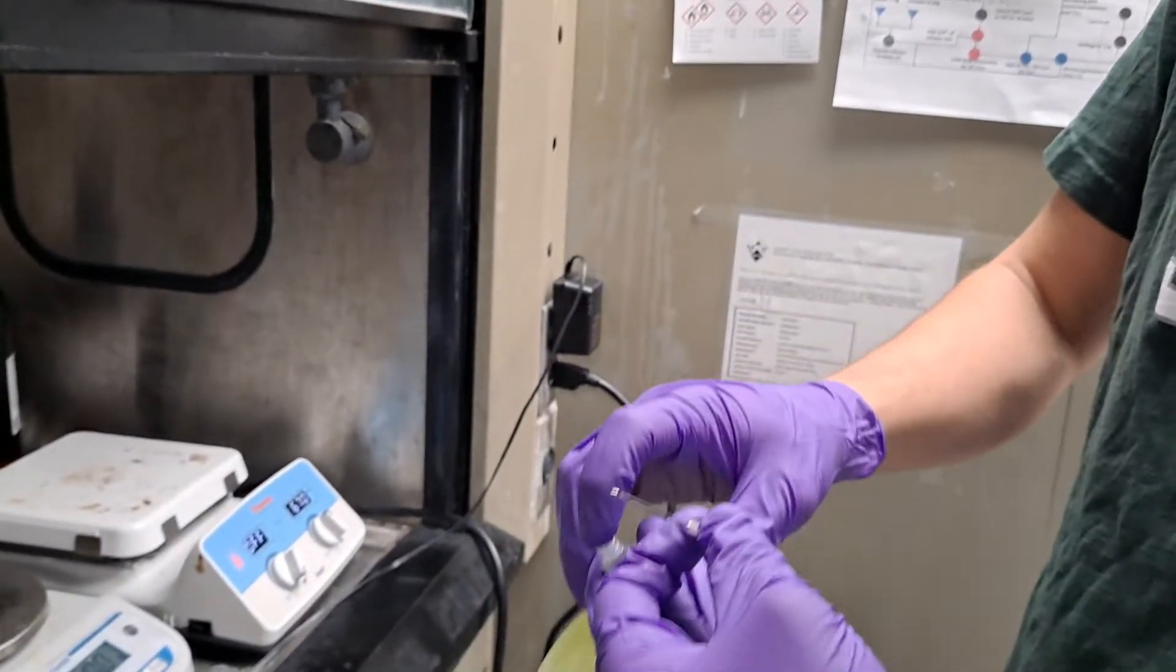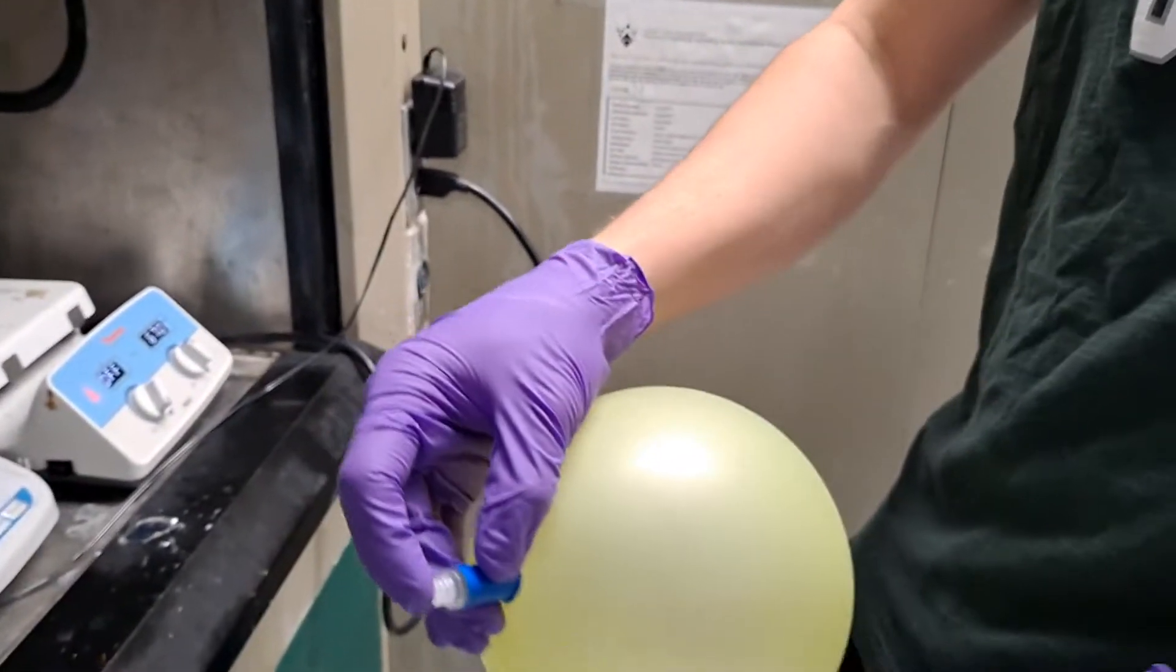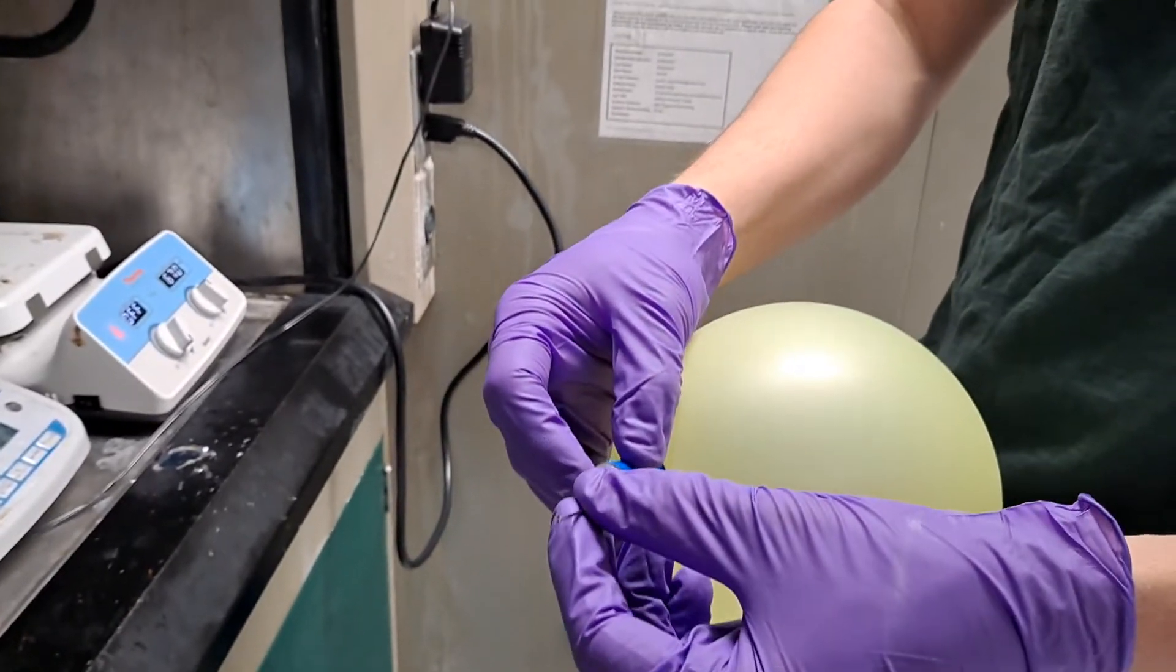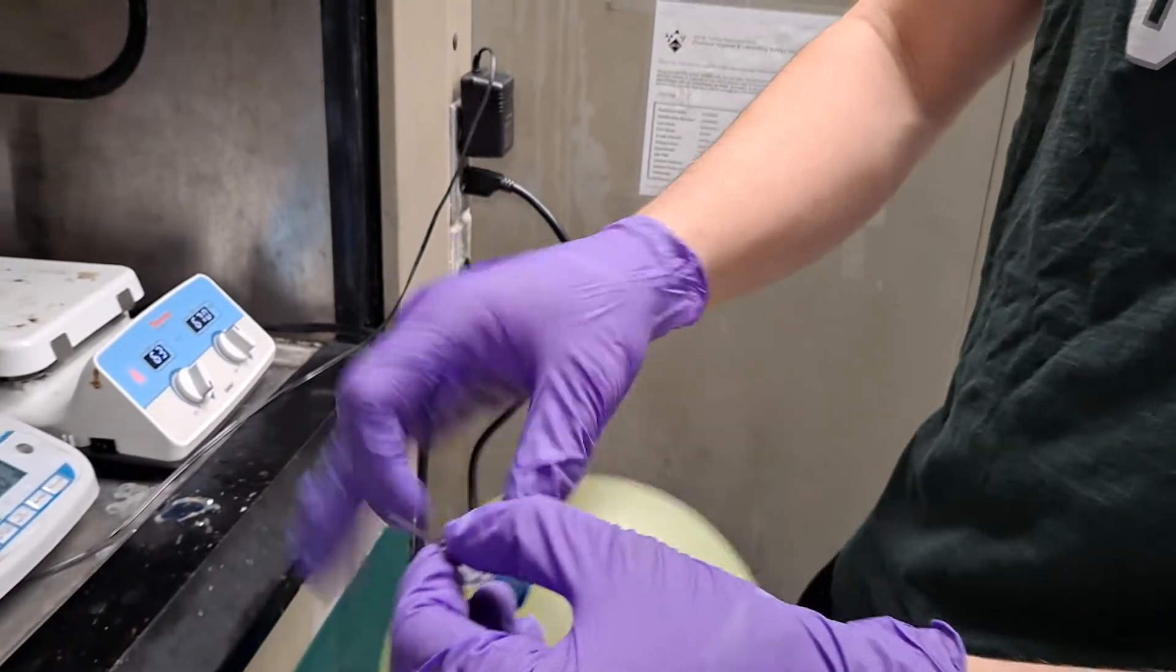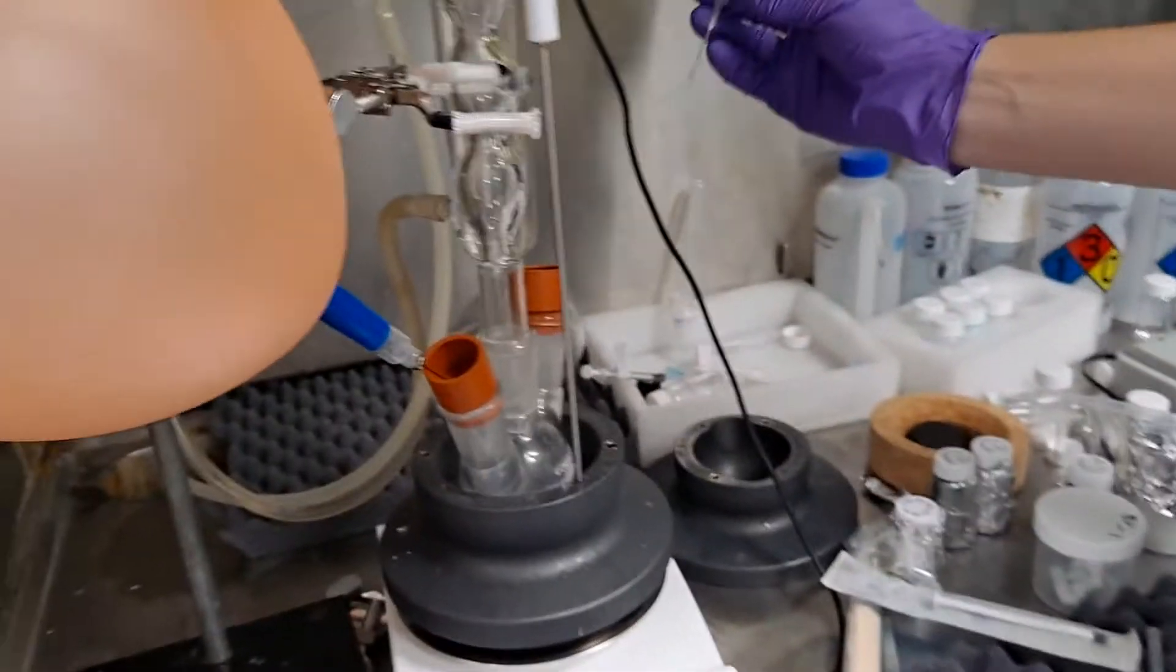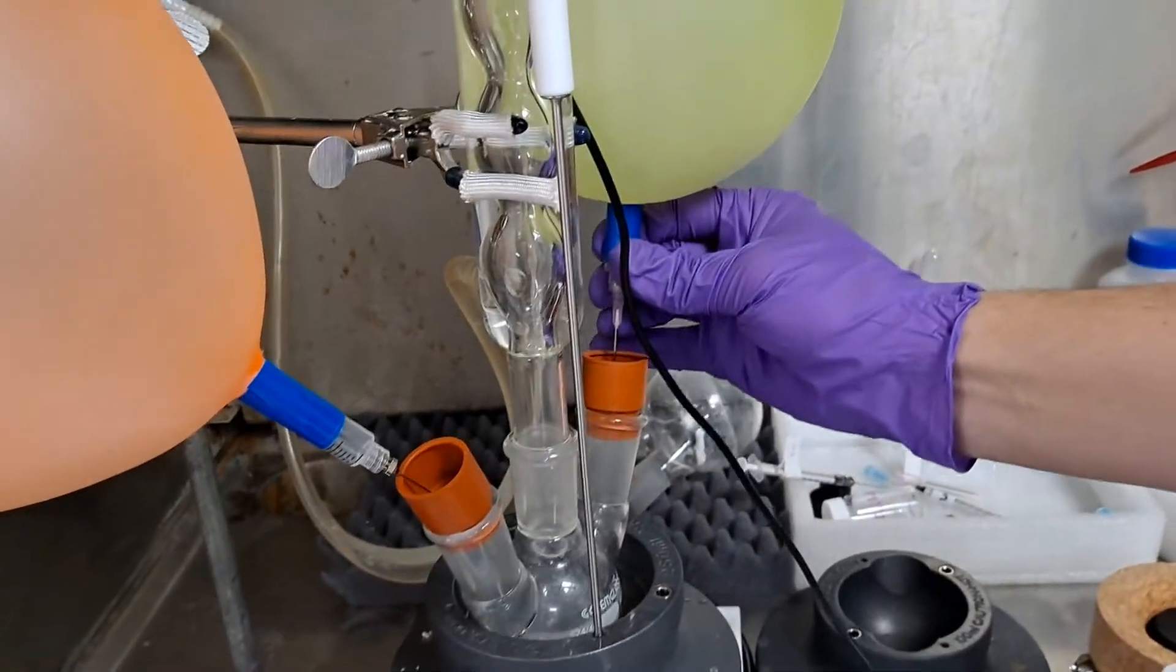All right, so next is where we put the balloon inside the reactor. Your finger is over this to make sure the gas doesn't come out, and you'll quickly remove your finger and put on the needle. Then come over to the chamber and just poke it in.